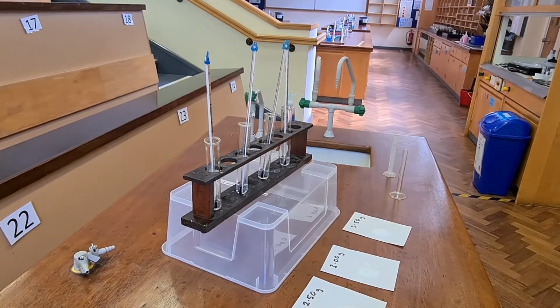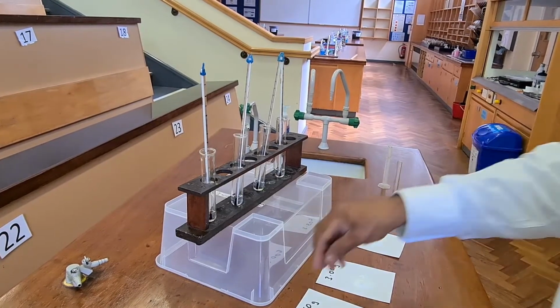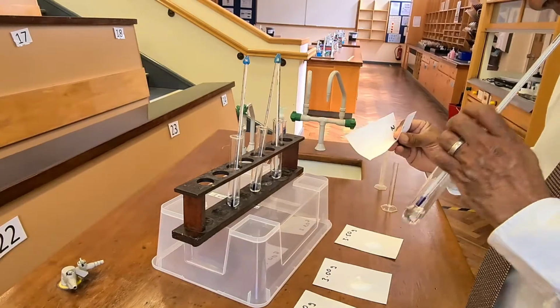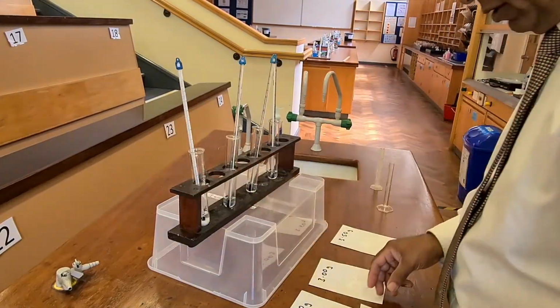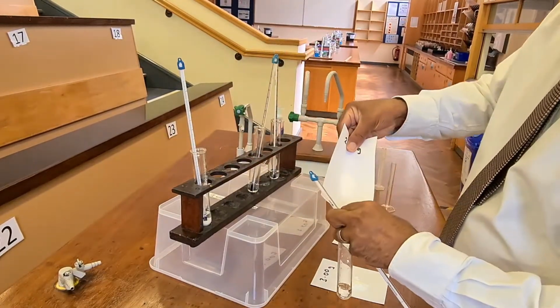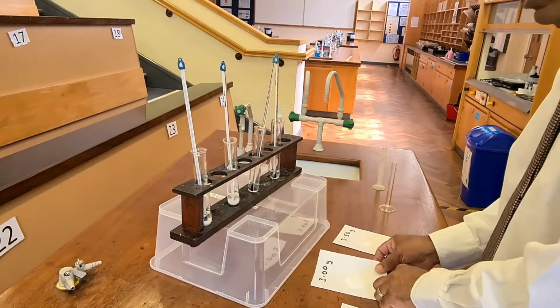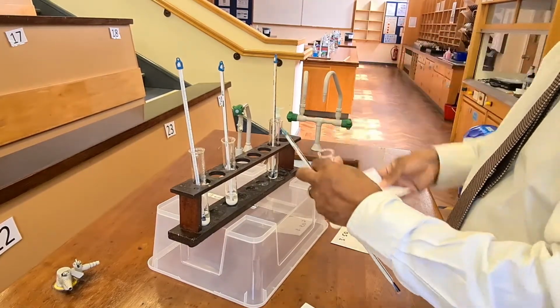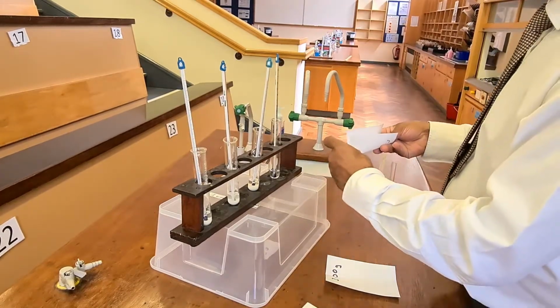My phone keeps going off again. So I'm going to repeat the experiment 4 times as follows. 2 grams in the first test tube, 2.5 grams in the second test tube, 3 grams in the third test tube, 3.5 grams in the fourth and final test tube.